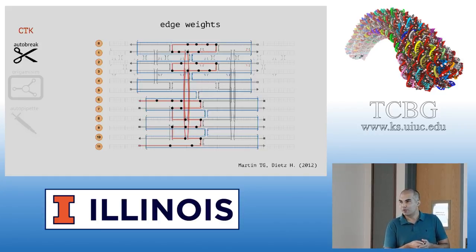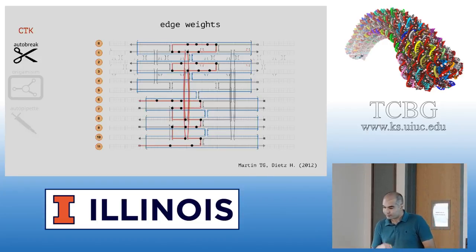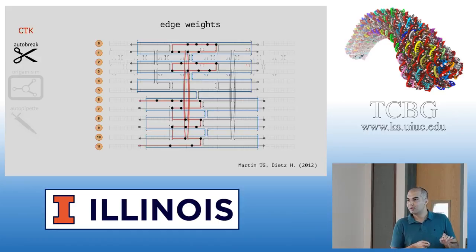Actually, my starting point was this paper. I said, maybe I can turn those heuristics, put those heuristics into the edges here, and then try to automate the process. It actually started like this, but then I decided we can turn this into a more quantitative tool that is independent of any heuristics, just based on the DNA thermodynamics that we already know that has been controlled really well.